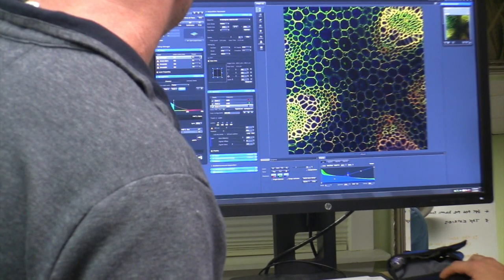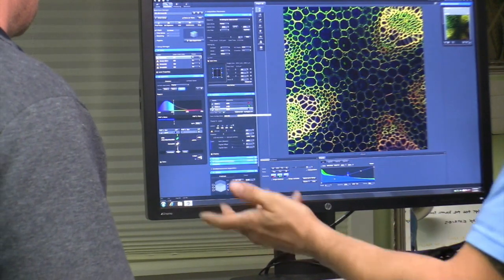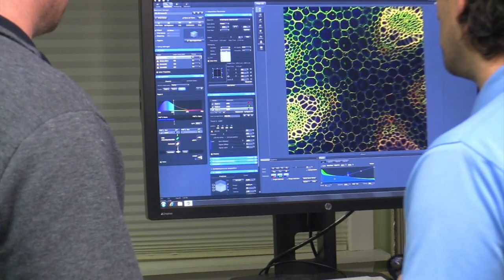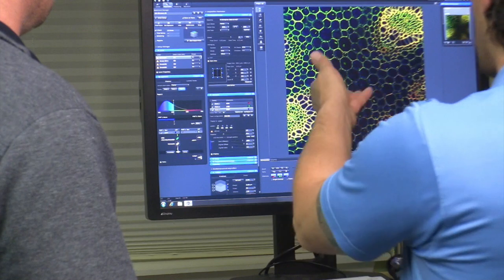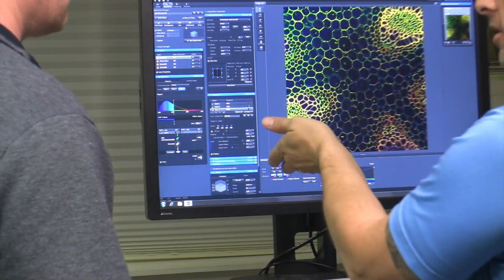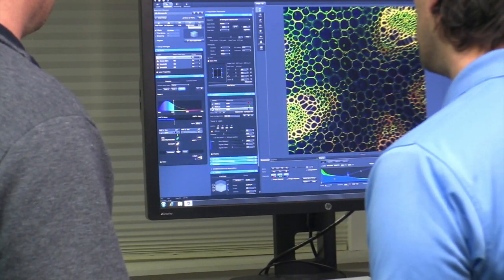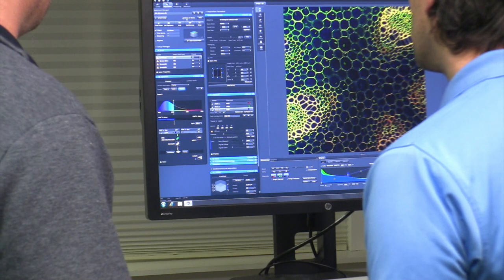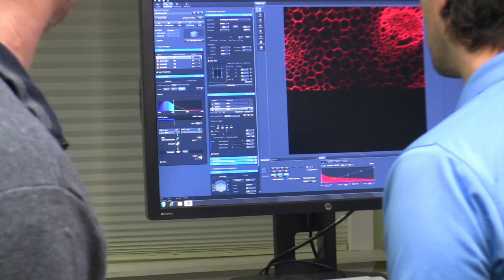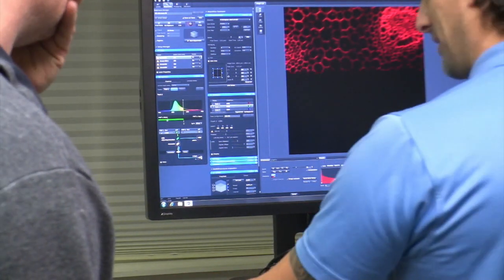Then the other function is a Z-stack, and this just moves the focus drive up and down, so it gets a little tighter. It's just going to go through the depth, so it's going to take a couple different images at the top and the bottom, so then you could zoom through the whole sample. Got it. This is faster. Fascinating. Yeah, it's pretty cool.